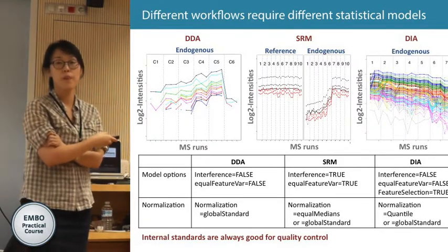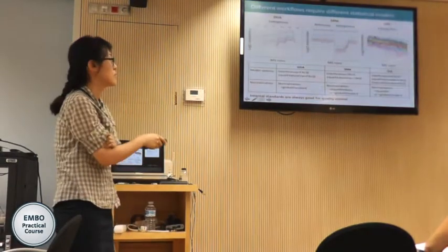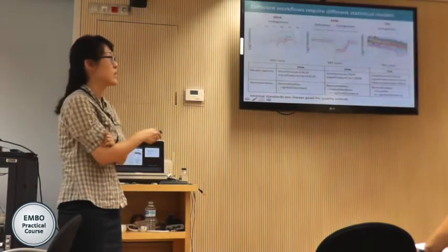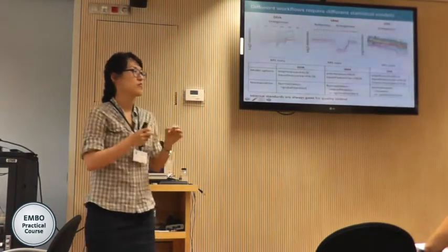Meena, why for the DIA type of experiment do you assume interference is false? It's really hard to.